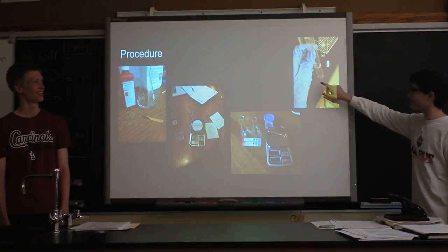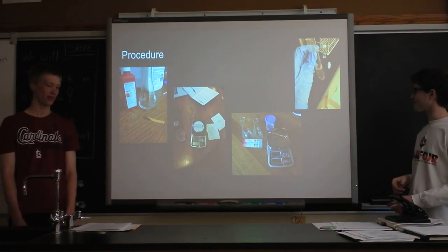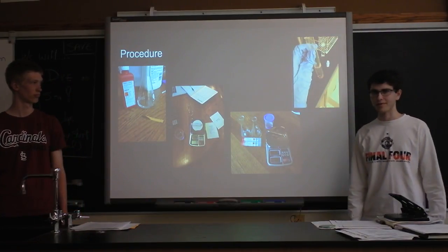This is really hard to see, but I was super excited because this is actually when we successfully isolated the red blood cells from the blood itself. I mean, this is just water on top, but those are the physical red blood cells.